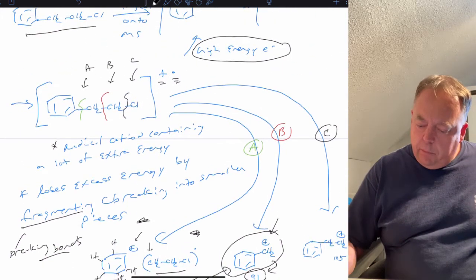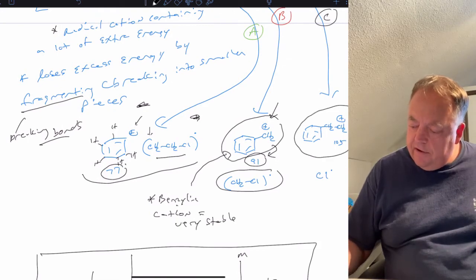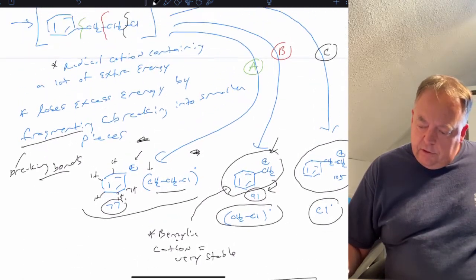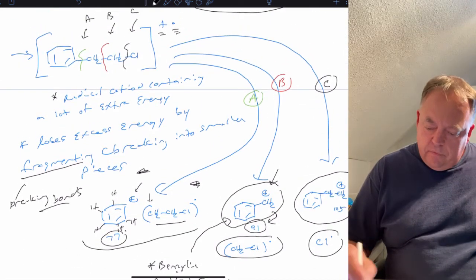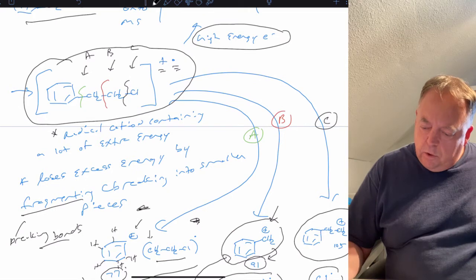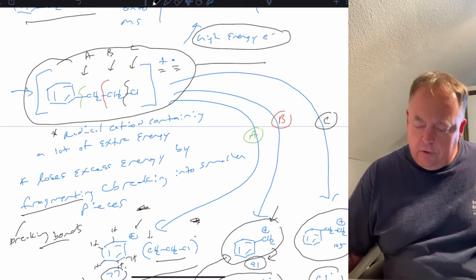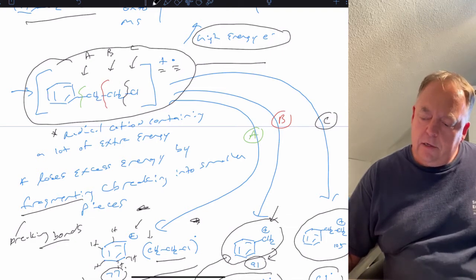Or if we break apart bond C and we get this fragment, it has a mass of 105, and then you would have a chlorine atom. So the point is, this molecule that you started with, maybe that hits the detector, which ideally you want, because that represents the entire molecule. If that hits the detector, then you get the mass of the entire molecule.